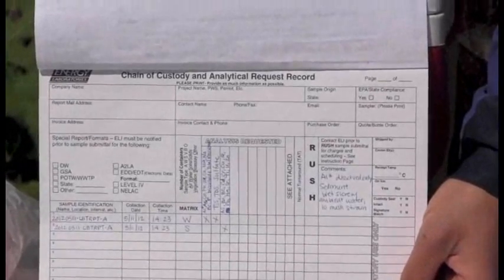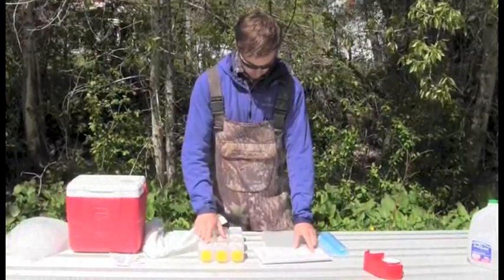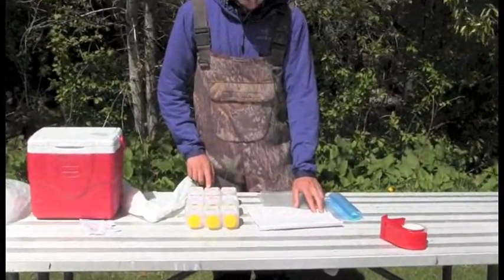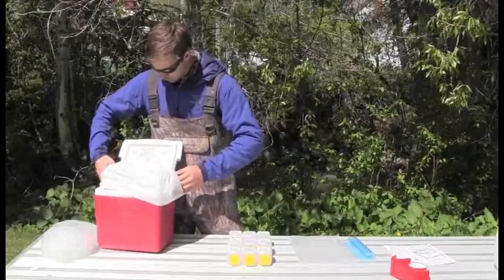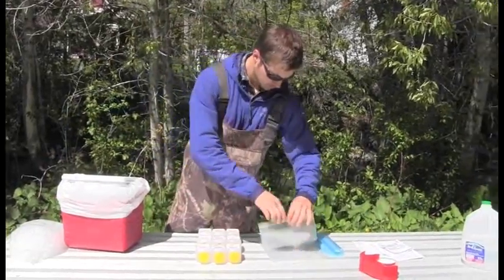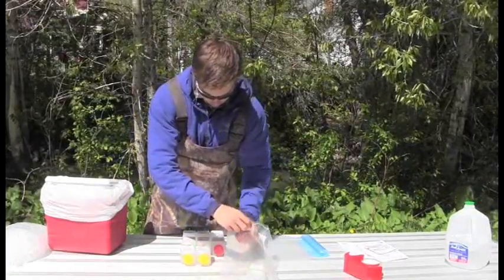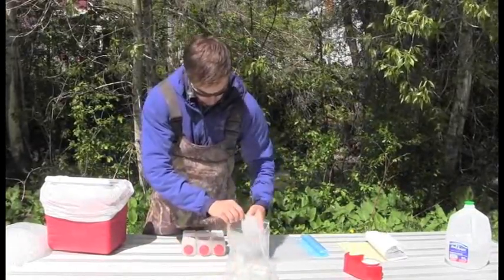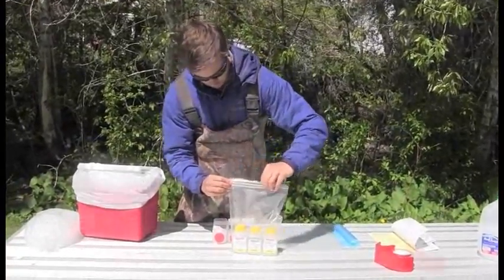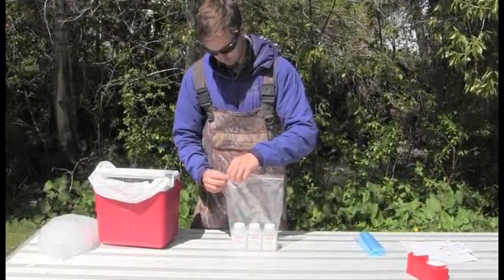Before packing the cooler, fill out the chain of custody form by following the example provided in your field protocols. Next, double check all the sample labels and the chain of custody form to ensure everything is properly filled out. Now we are ready to pack our samples. First line your cooler with a garbage bag, then place your samples in Ziploc bags, grouping them by preservative type. Group all of the samples preserved with sulfuric acid, nitric acid, and those that are not preserved at all separately. Separating the samples in this way will help to prevent contamination if a bottle accidentally opens en route to the lab.